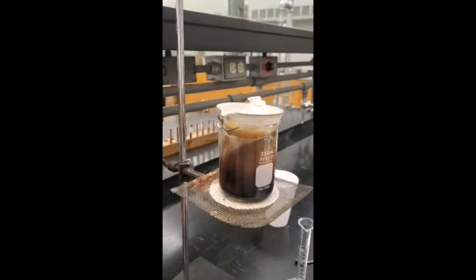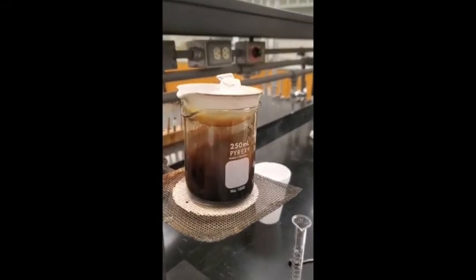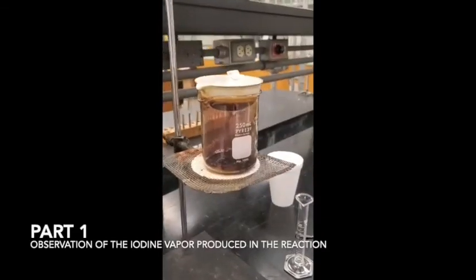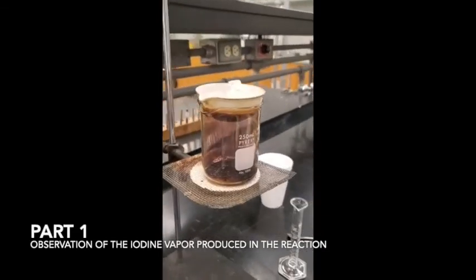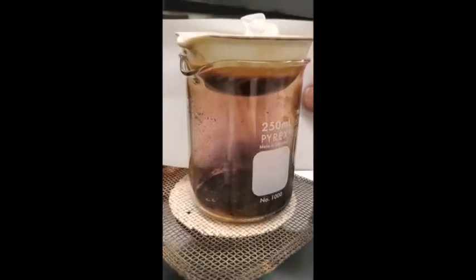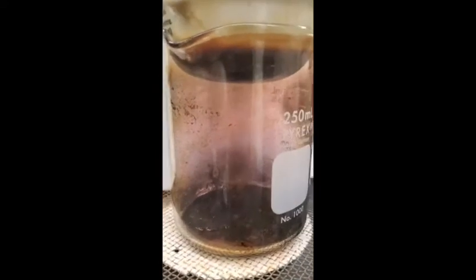Now we'll just heat it gently, and just let it go. Okay, now you can see the vapor. Let me put a white background. You can see the vapor in there now. It's starting to crystallize on the bottom of the evaporating dish.